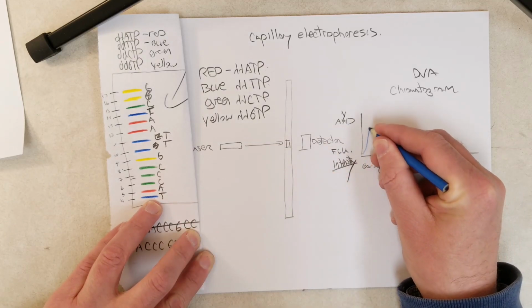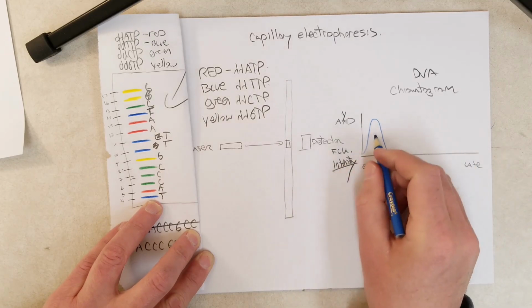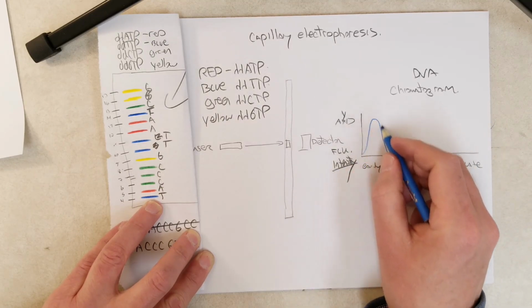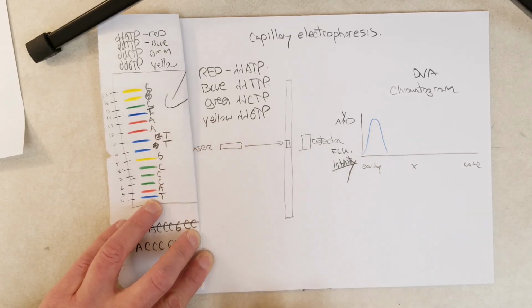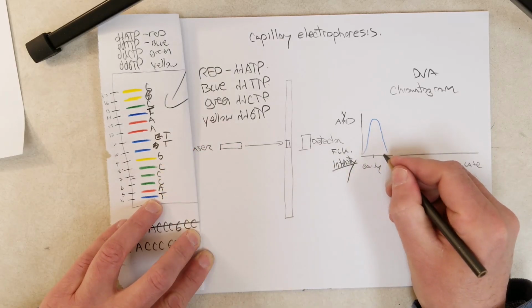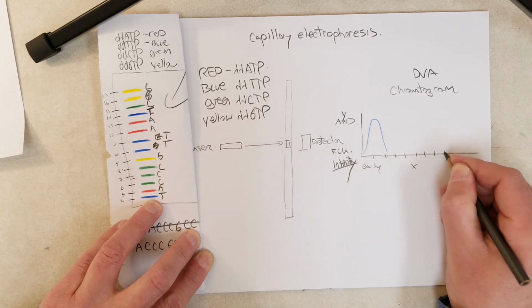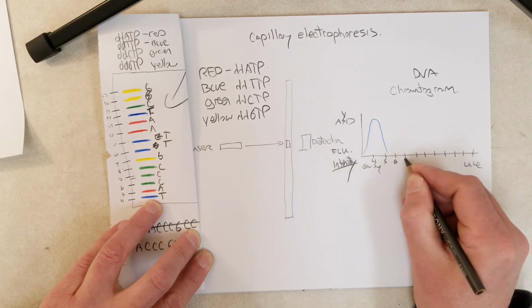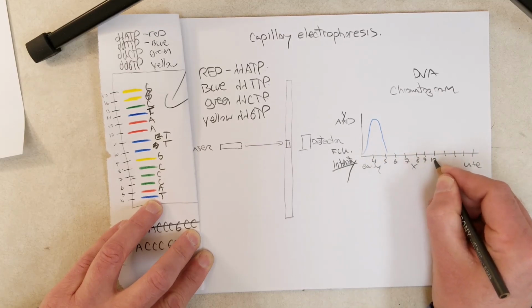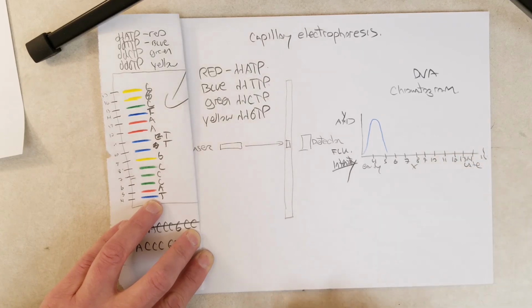So the first thing that comes through is blue. Okay, so we have this blue peak right here, because the blue intensity was very high. And then the next time we see blue, it's not going to be for a while. I'm going to put little marks in here so I can make a nice neat chromatogram for us. So this is 4, 5, 6, 7, 8, 9, 10, 11, 12, 13, 14, 15.